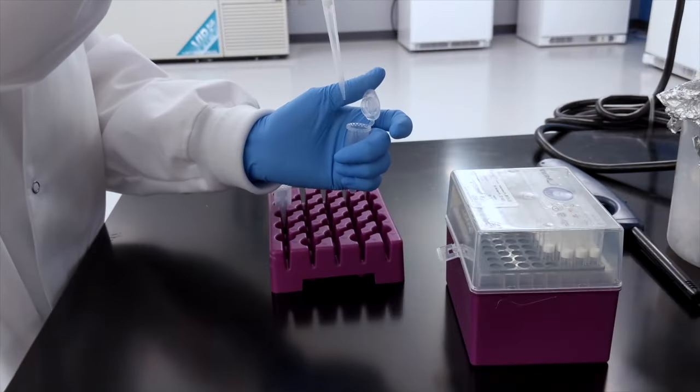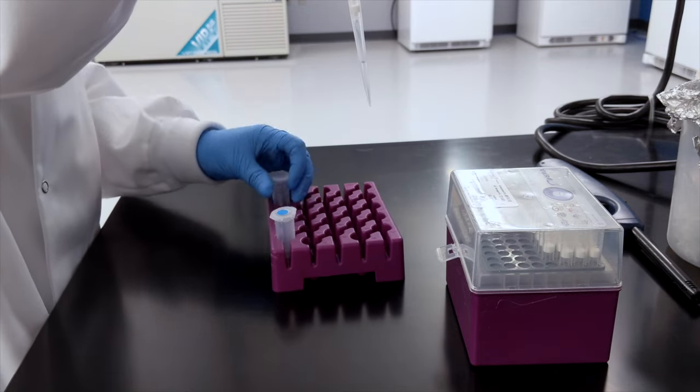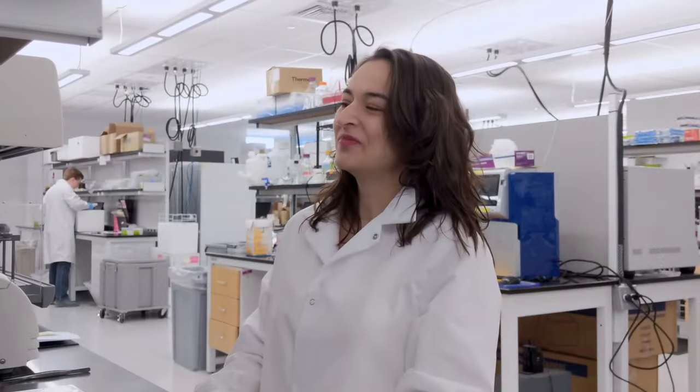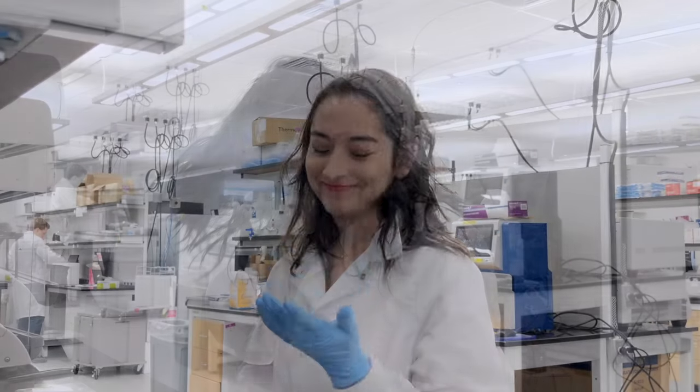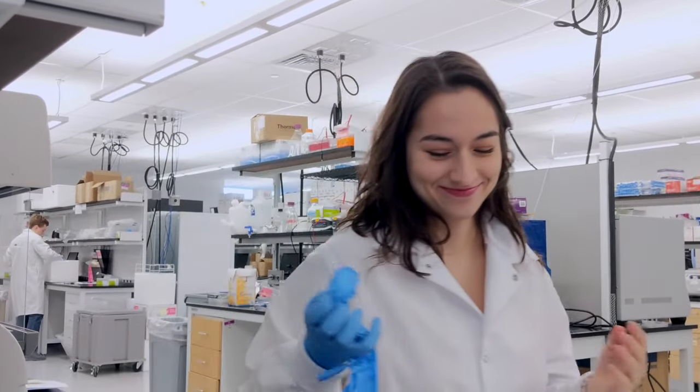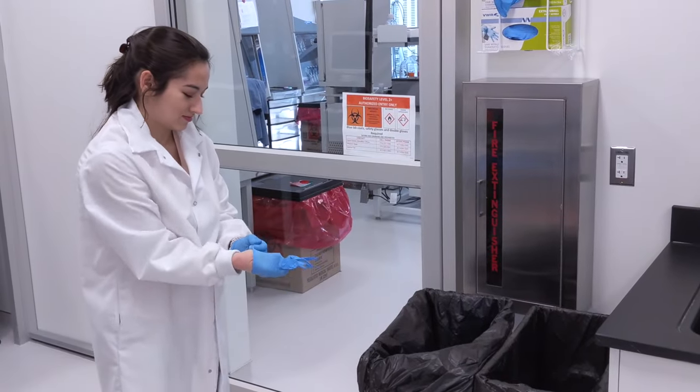While gloves are meant to protect users from the material they are working with, they also protect the material from user contamination. To keep your gloves clean, avoid touching your skin and hair, as well as your cell phone, writing utensils, or other unsterilized objects. Always change your gloves if you touch something unsterile or are starting a new task.